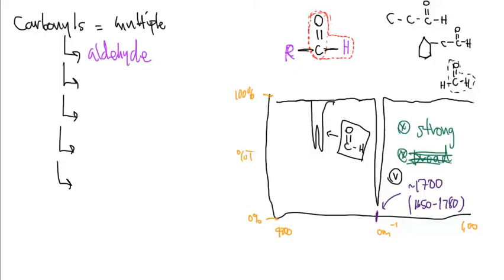Now, where do those double dips happen? Those numbers, again, are very important, right? So these dips will happen beside of each other. And this will always go on at around 2800 and around 2700. We call it a double peak. Sometimes you'll hear me refer to it as the bunny ears because they are literally side by side. And there's not a lot of wiggle room here.